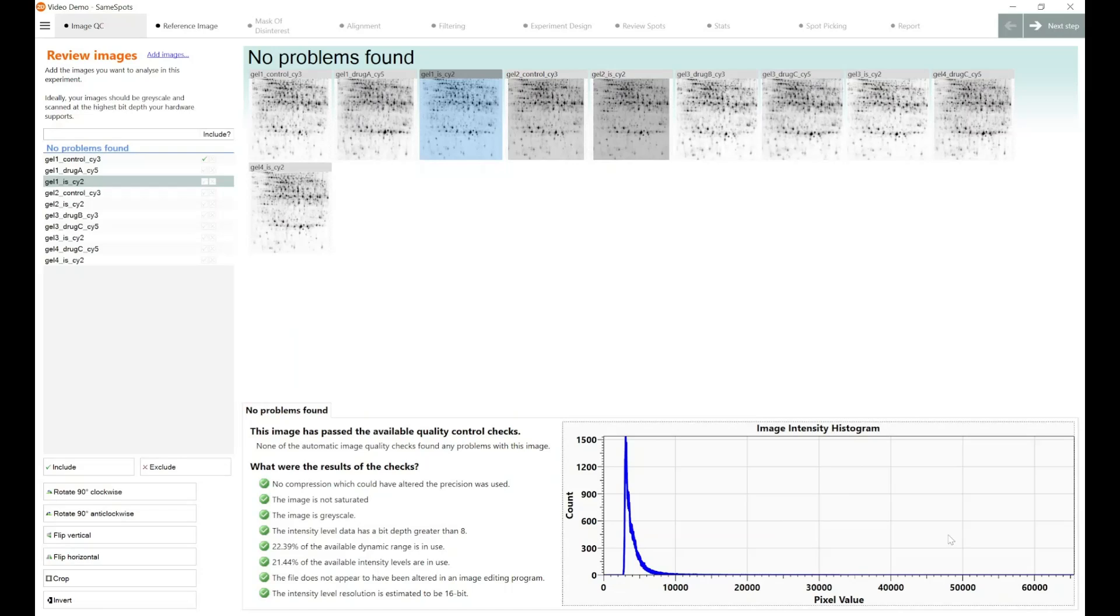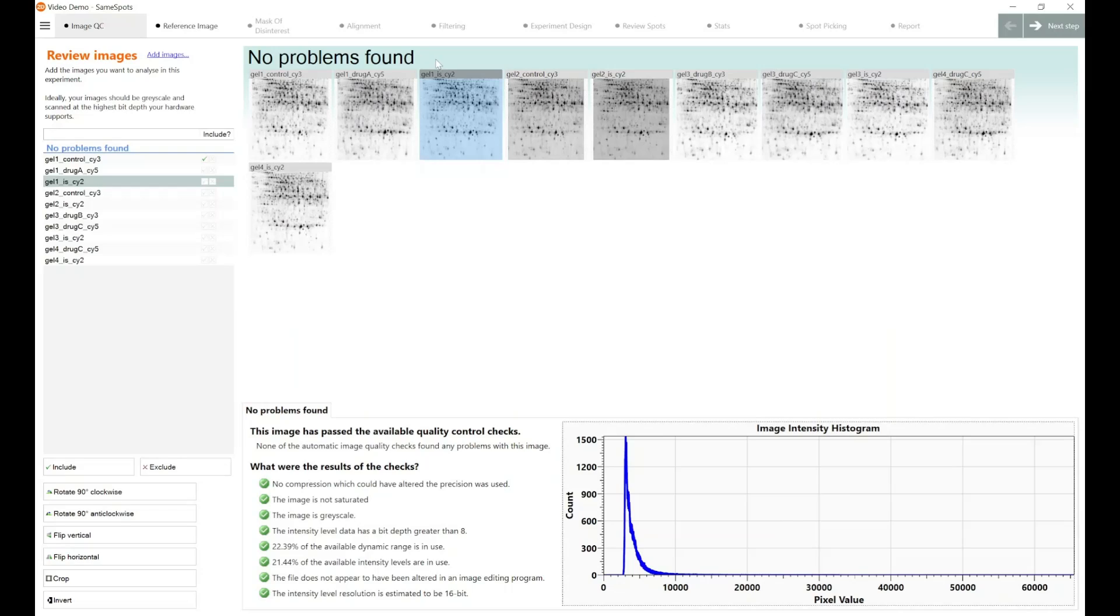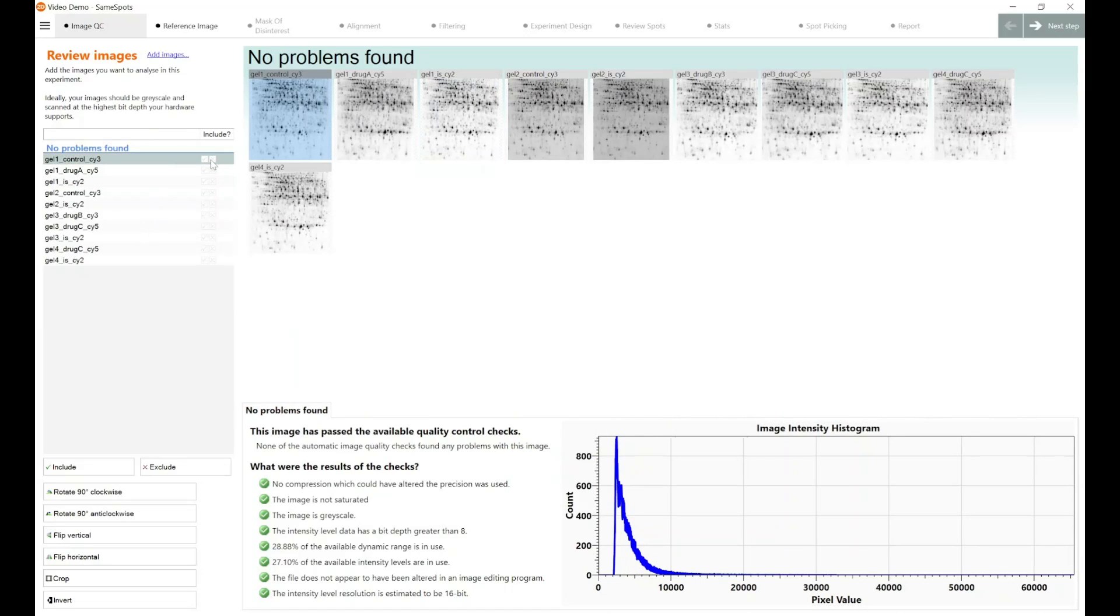When you first bring your images into SameSpots, and I've got a number of demo images here, you can see that SameSpots actually scans those images to find any common problems that could impact your analysis or could have an effect on the data that you can retrieve from the image. On the left hand side we've got the option to include or exclude them. So if you brought your images into this window and you found some images that weren't quite reaching the quality control parameters, you can exclude them from your analysis.